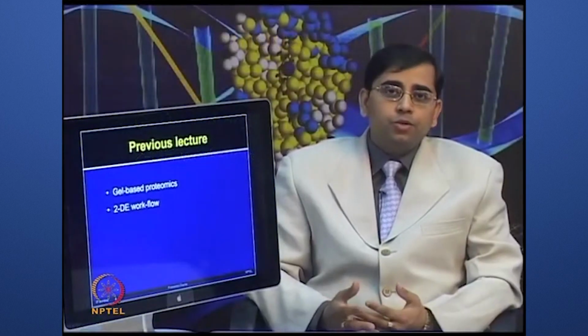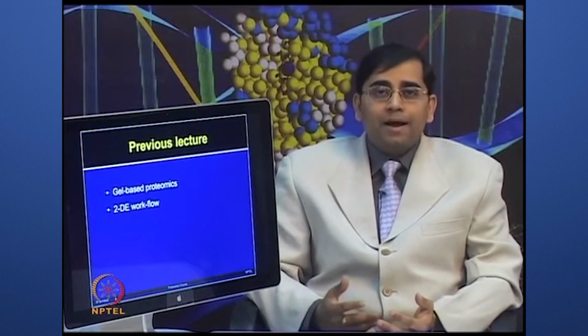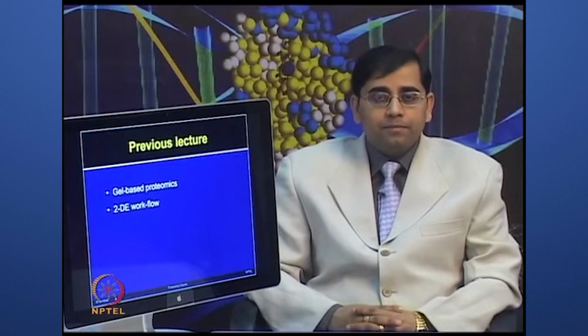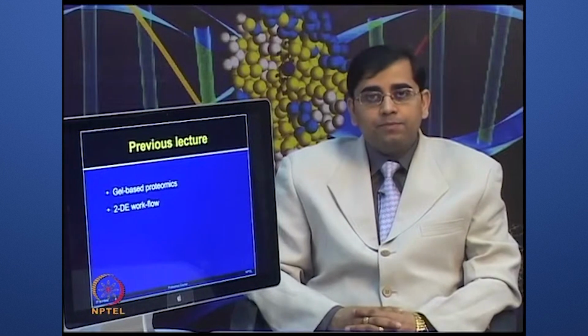In between these two, what is required to make these strips compatible for SDS-PAGE was discussed in the equilibration steps, and then the second dimension separation using SDS-PAGE.